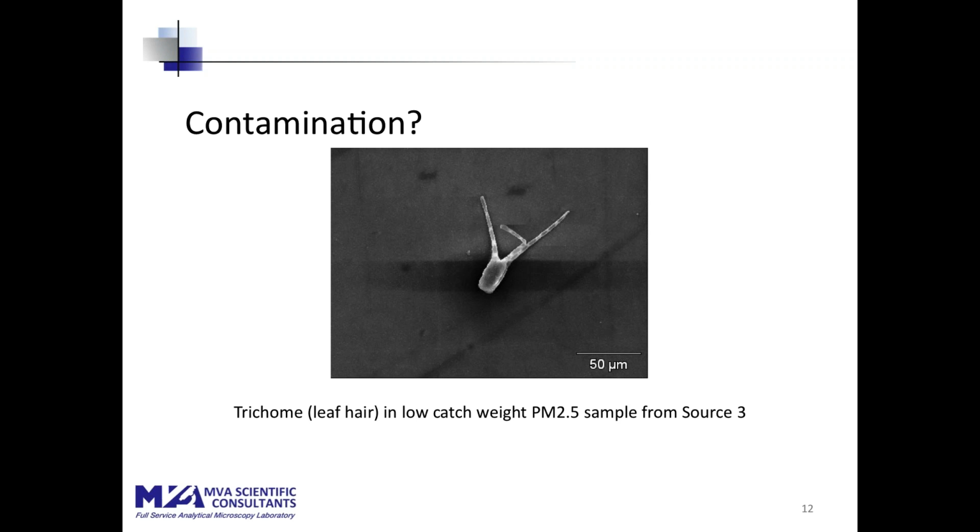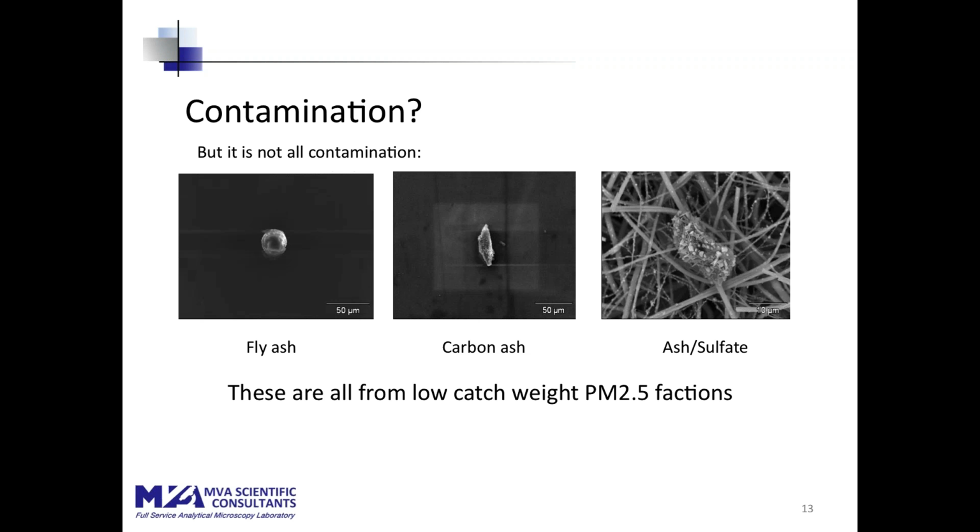But you can't explain all of the greater than 2.5 mass in this ostensibly less than 2.5 micron catch by contamination. These are also particles from low catch weight PM 2.5 fractions.